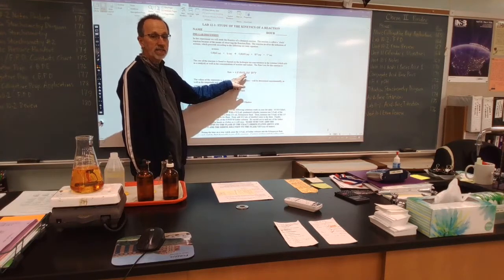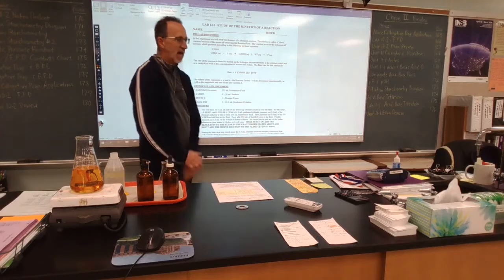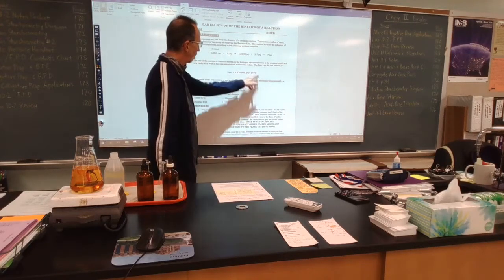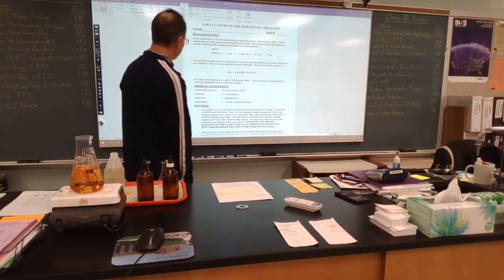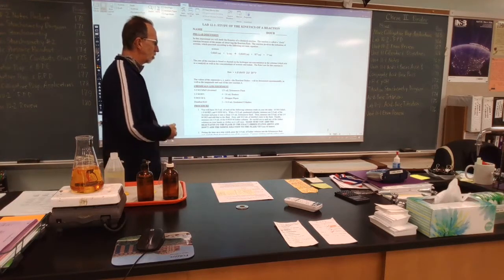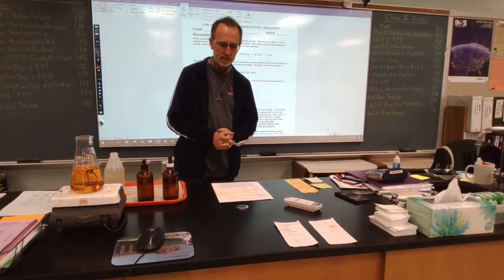Times the iodine concentration to a power, times the H+ concentration to a power. These are the three factors that we're going to determine. The values of the exponents will be determined experimentally, as well as the magnitude and unit of the rate constant as well.